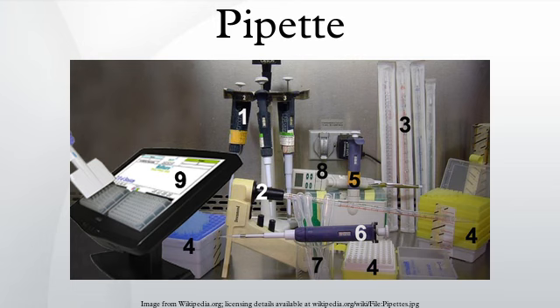Volumetric pipettes. Volumetric pipettes or bulb pipettes allow the user to measure a volume of solution extremely accurately. These pipettes have a large bulb with a long narrow portion above with a single graduation mark as it is calibrated for a single volume. Typical volumes are 10, 25 and 50 milliliters. Volumetric pipettes are commonly used to make laboratory solutions from a base stock as well as prepare solutions for titration.